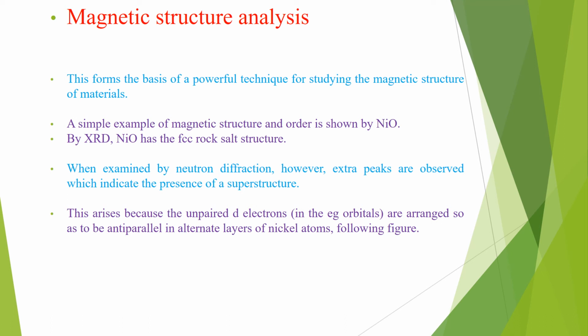Dear student, in this slide, we will discuss magnetic structure analysis. The magnetic properties depend on the presence of unpaired electrons, especially in d or f orbitals.